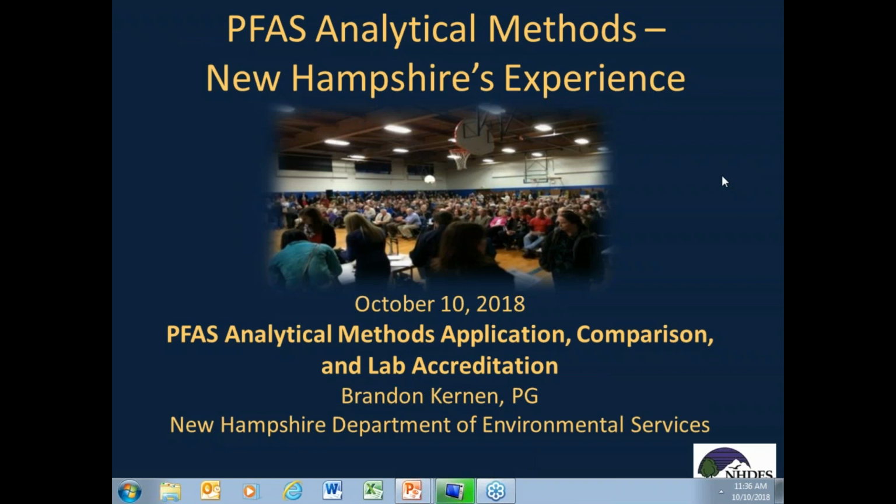Thank you. Today I'm going to go over New Hampshire's experience with sampling PFAS, as well as go over a primer that ASWA has developed. We have a PFAS work group that we've developed that provides guidance to state drinking water programs and also water systems on how to assess PFAS.